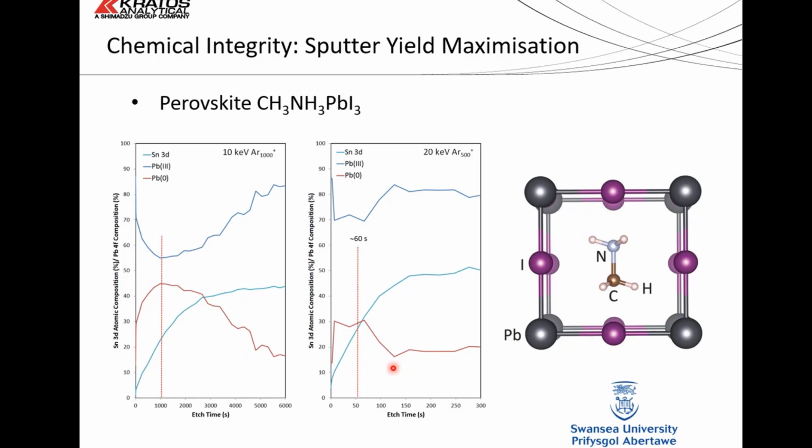Unfortunately, I don't have a golden rule about which side you have to maximize or minimize for what kind of material. I think most analysts would have to put some time and effort into working out which is right for their particular systems. Although I would say that it happens more often with inorganic materials that you have to maximize the sputter yield, whereas organic polymers are generally safer with trying to minimize the damage.